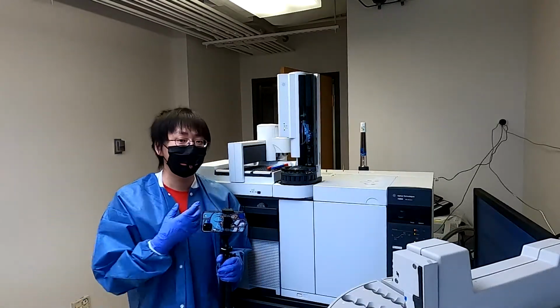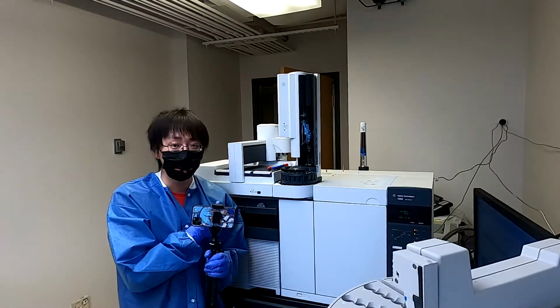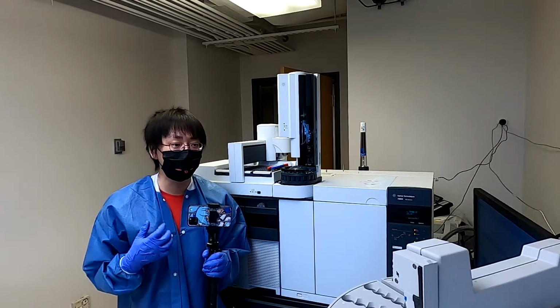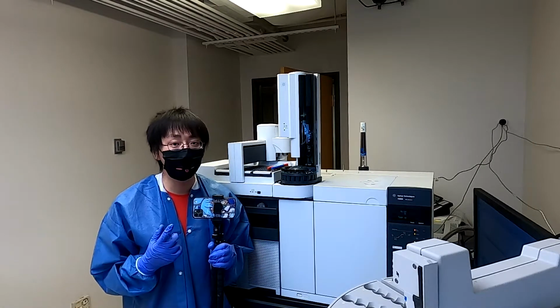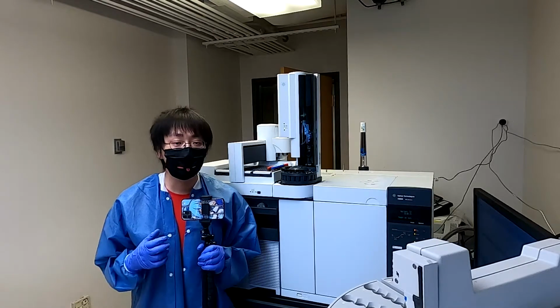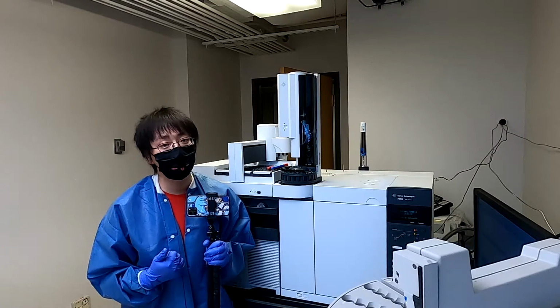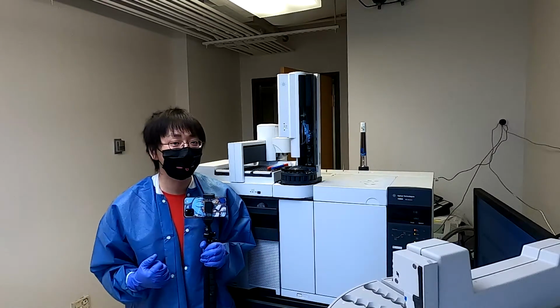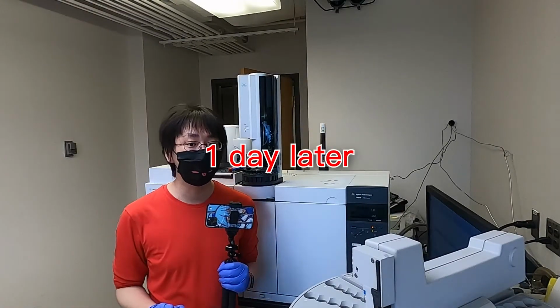Now the GCMS will analyze the concentration of DDT in each of the samples, and finally we can get the result. For each vial, it will take about 1 hour for the analysis. So we need to wait at least 13 hours. So let's just wait for 24 hours and come here tomorrow. And so now we have the GC result here.